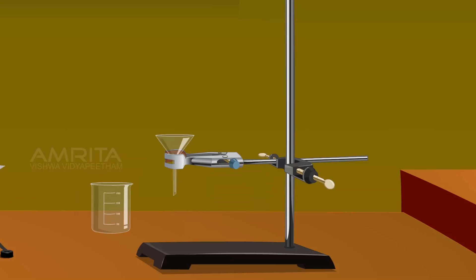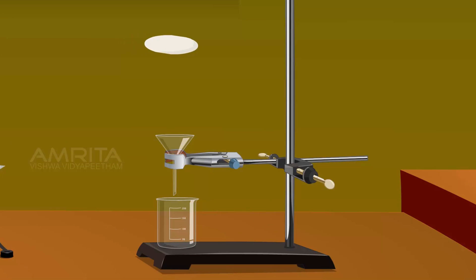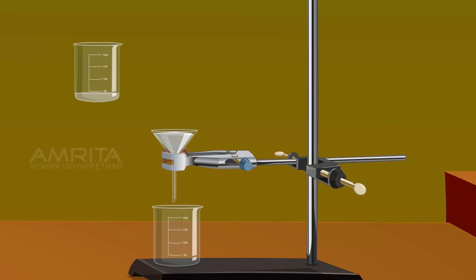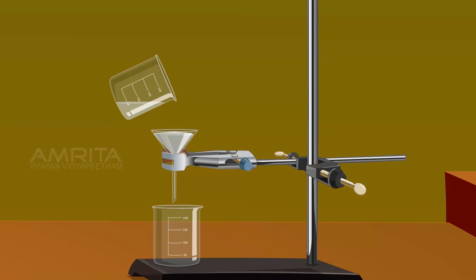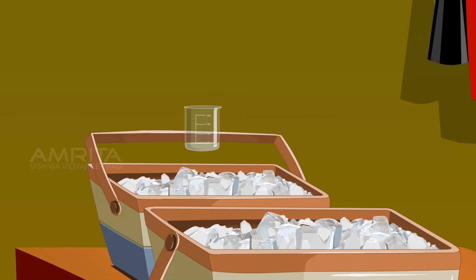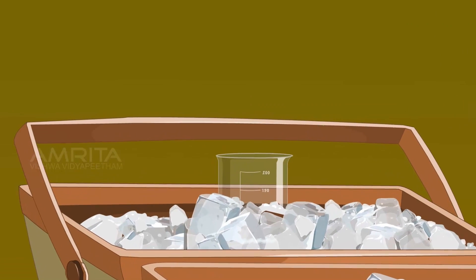Place a beaker under the funnel and fix a filter paper in the funnel. Take the beaker containing the solution and filter the hot solution into the beaker. Cool the solution by placing the beaker in ice. On cooling, colourless crystals of para-nitroacetanilide separate out.